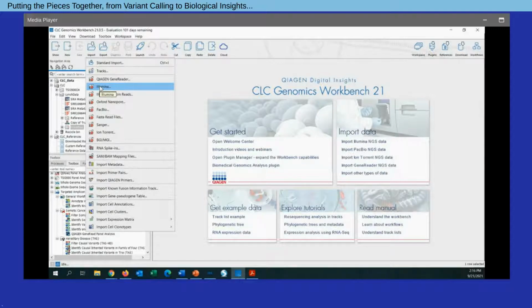software. The other thing that we would do with this import as well is that we can bring in information with regards to any primers, let's say, that were used on your particular panel of interest. And in addition to that, we can bring in track-based information or the BED file noting our targeted regions. So again, very simply through a couple of clicks in the dialog, you can get your necessary reference information and both your sample and experimental specific information into the software quite easily.